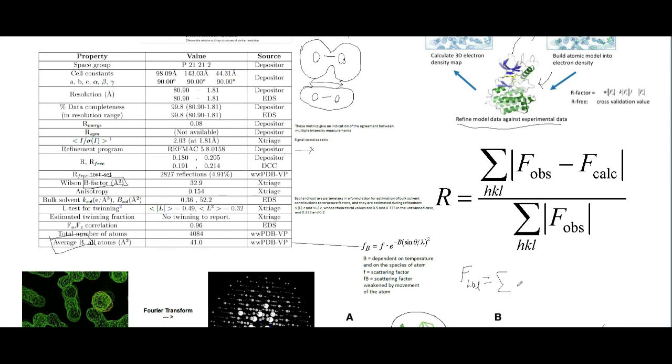from the atomic structure factor, which was our F, then our e to the positions, which I'll just write as R rather than writing it out.